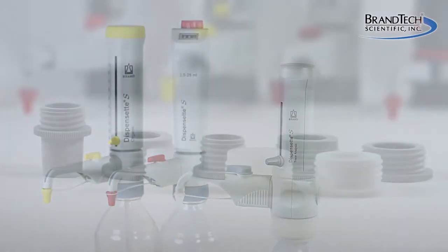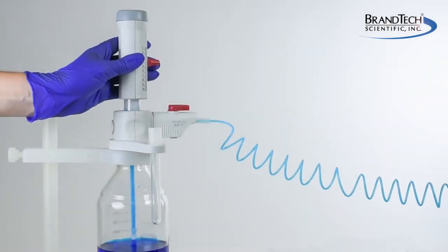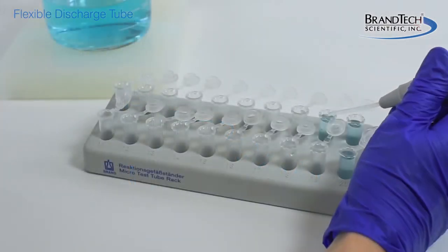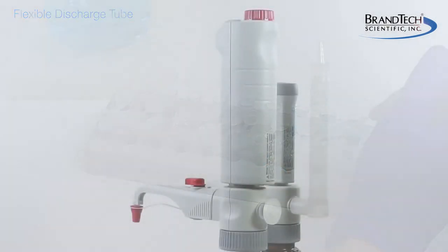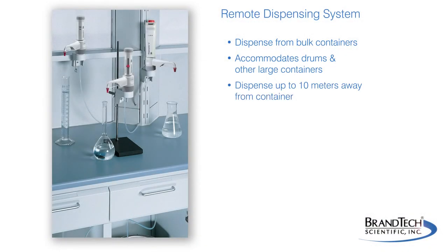A wide range of accessories are also available, including a full complement of adapters to fit nearly any unpressurized container. The flexible discharge tube makes serial dispensing safe and easy. Drying tubes and micro filters are also available, and the remote dispensing accessory allows dispensing from bulk containers.